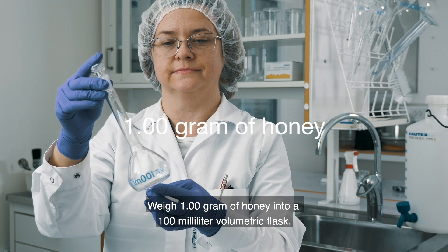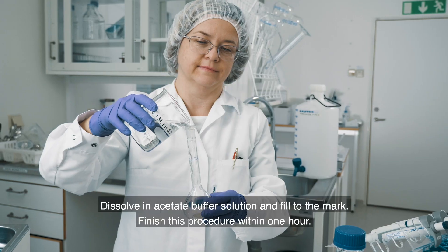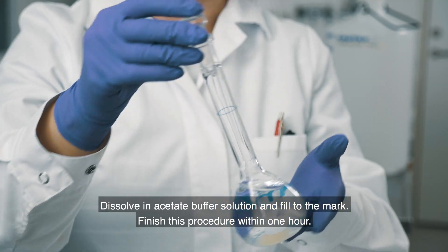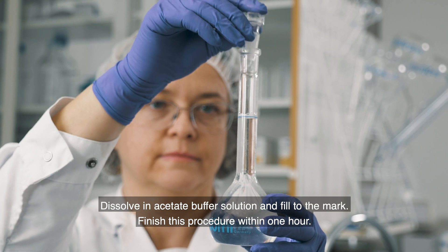Weigh 1.0 gram of honey into a 100 milliliter volumetric flask. Dissolve in acetate buffer solution and fill to the mark. Finish this procedure within one hour.